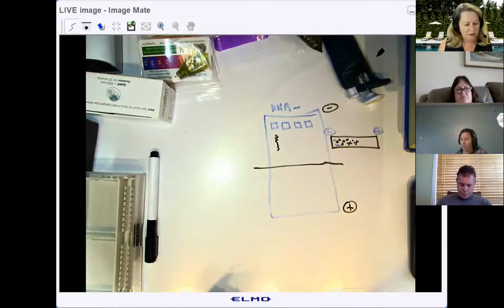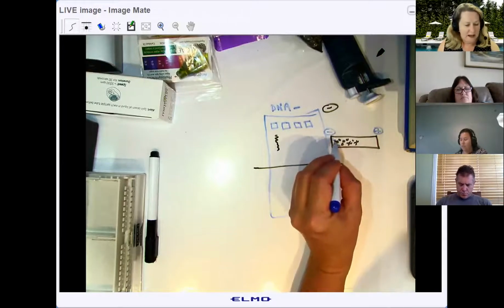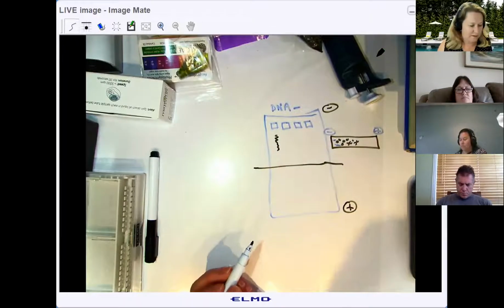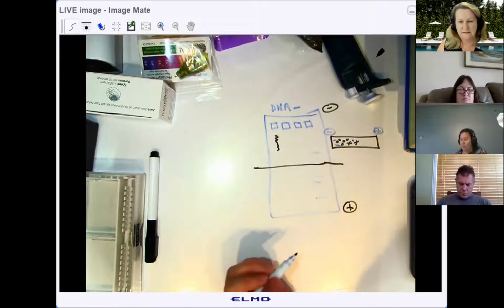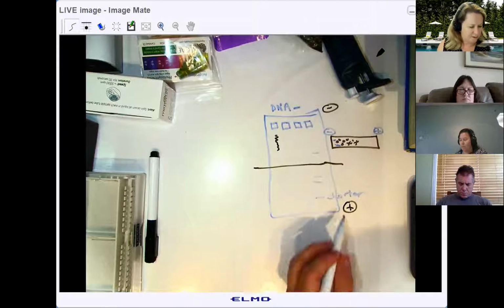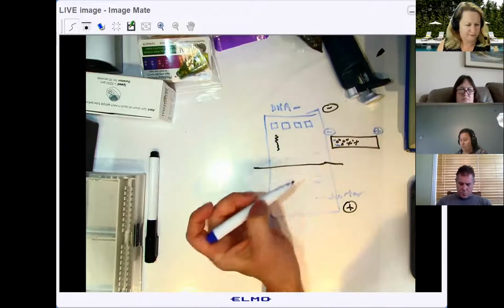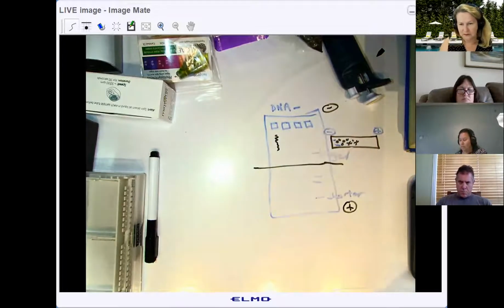The longer pieces are going to get more hung up, and the shorter pieces are going to have an easier time of working their way through the gel. So you get a series of bands on the gel, and the shorter pieces will migrate further, and the longer pieces will be closer to the top of the gel. Does that kind of make sense, you guys?